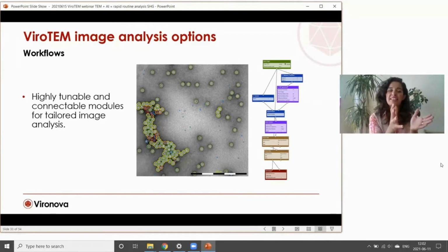So here you can see that your image analysis takes place here. You're connecting together the boxes, and you can then do detections like identifying particles, AAV particles, intact particles, broken particles, clusters, aggregates, debris. All of that is done in this one image with this one workflow. And that is really useful, extremely useful actually, when you have got something with a well-defined or describable shape.